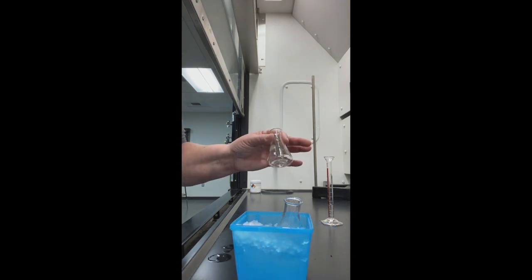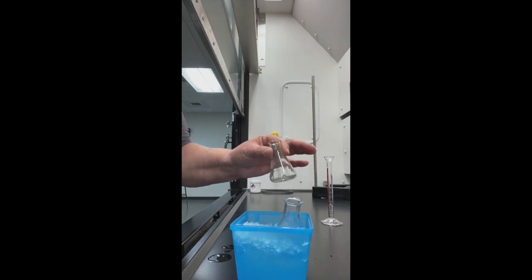Now in a separate flask, I'm going to mix three mls of concentrated sulfuric acid with three mls of concentrated nitric acid, and I'm going to cool that in a separate flask, but in the same ice bath.